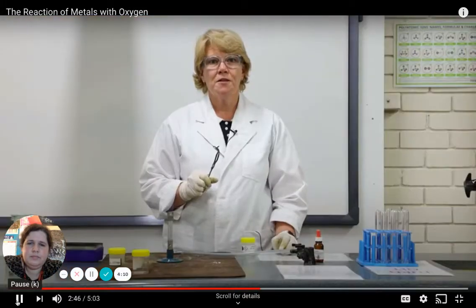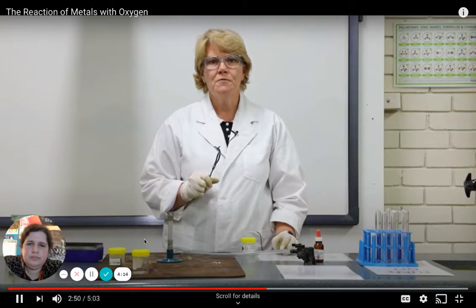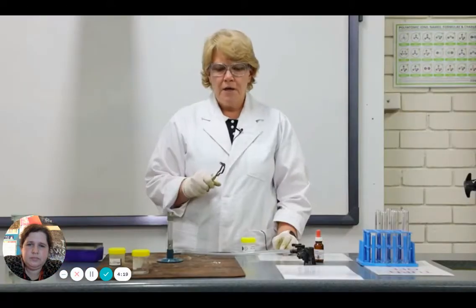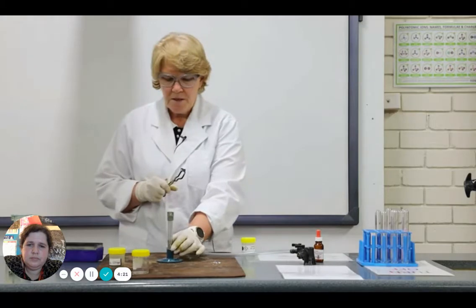Now it's time to look at the reaction of zinc with oxygen. Zinc is also a shiny grey metal. You can see how shiny that is. Now I'm going to heat that in my Bunsen burner flame and see what we get.